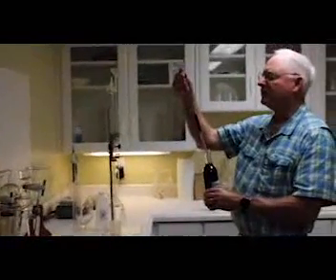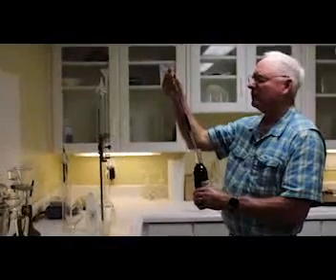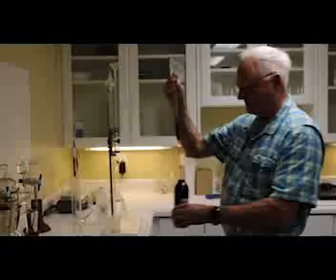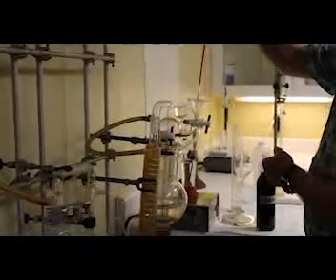So we have a 10 ml sample. Notice that I ran the wine through the pipette first. It's always good to have good lab technique. Make sure your sample is what you're running and not contaminated by a previous sample. So there's 10 mils going in.